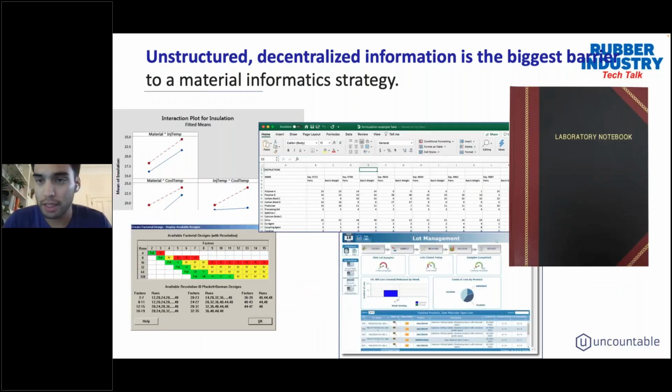So I name dropped a few of these systems just to reiterate what we commonly see across teams: spreadsheets being the number one thing used across all different teams, using DOEs, using LIMS systems, using lab notebooks, like I said, traditional electronic lab notebooks or the physical lab notebook. The status amongst ways of teams collecting data today has not really changed over the last few decades.